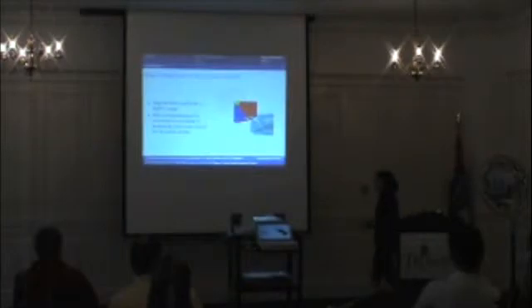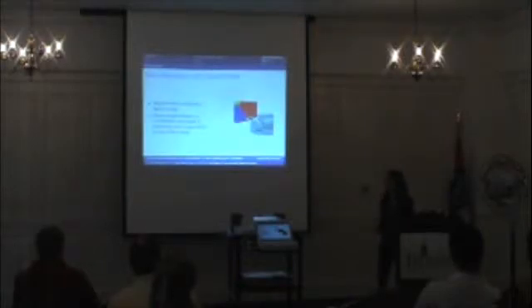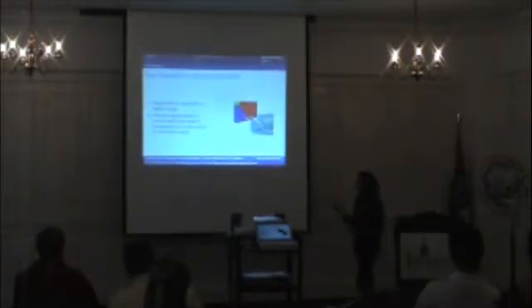Currently, manual segmentation has been done on the entire data set. It's really inconsistent, really tedious to do, and really boring. I'm sure MathBio doesn't want to pay us to play games all day, they'd rather have us do something more productive. And the results from segmentation are really important for getting valid numbers into this model. If we get crummy segmentation techniques, then we're going to get crummy values for surface area and volume, and even things in the images like pixel intensity that we might look at later on.